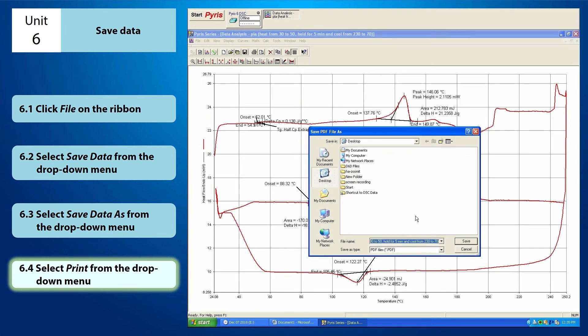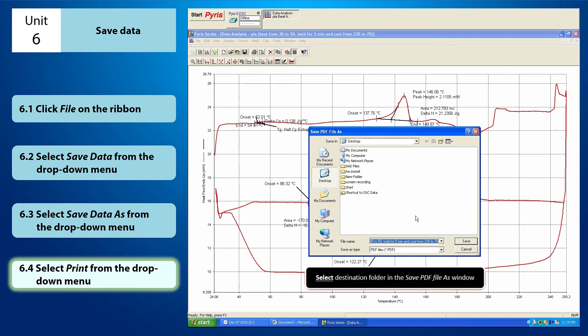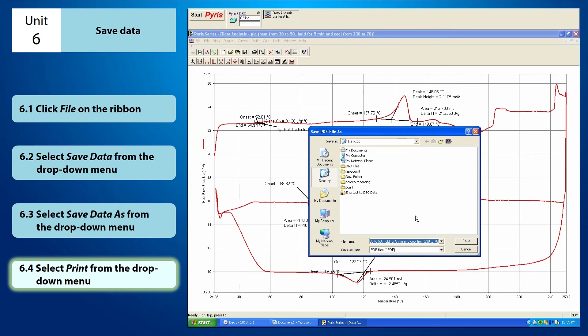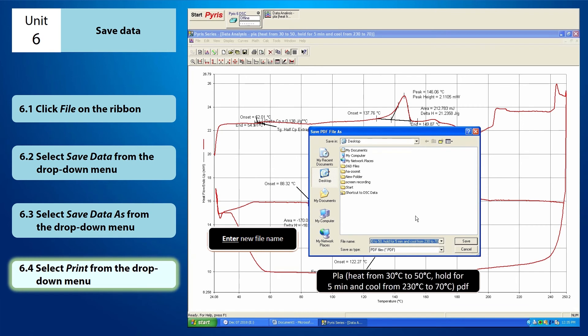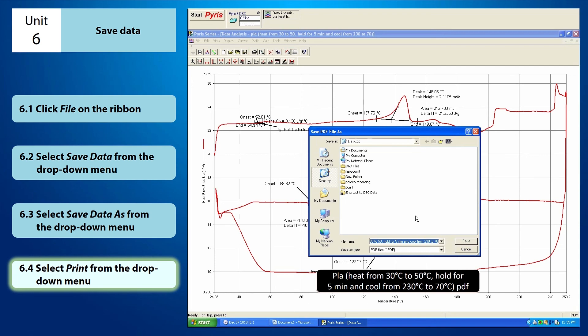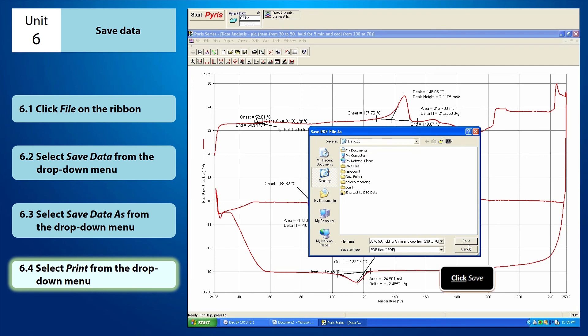This save PDF file as window will appear. You just have to select the destination folder where you want it to be saved. Now, I'm going to save my file on the desktop. And I'm going to rename it into PLA in bracket, heat from 30 degrees Celsius to 50 degrees Celsius, comma, hold for 5 minutes and cool from 230 degrees Celsius to 70 degrees Celsius, PDF. Lastly, click save.